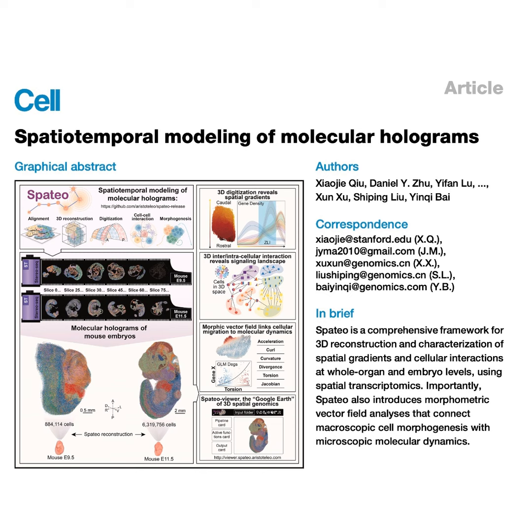We utilized the probabilistic math of Gaussian processes to computationally repair the microscopic tearing, and whole embryo mesh correction to snap the stacked volume back into its natural curve. Right, and then we deployed astrophysics field equations to generate custom contour-hugging coordinates inside those organic curves. We eavesdropped on the cellular gossip, using stratified subsampling to efficiently map the massive cellular signaling network, tracing the message from membrane ligand down to nuclear DNA.